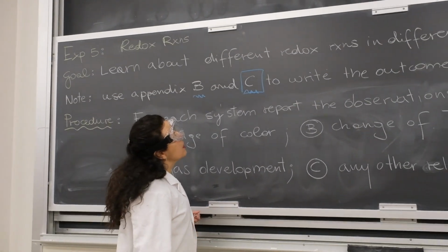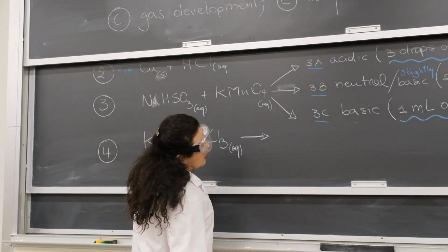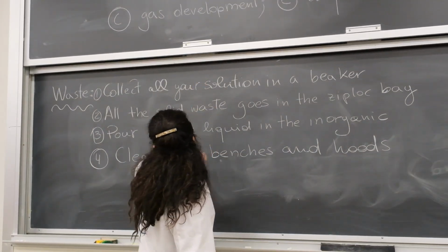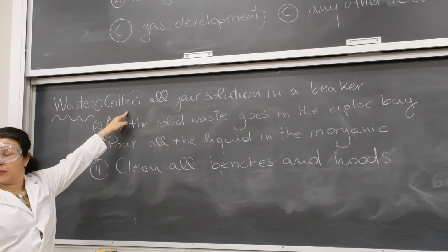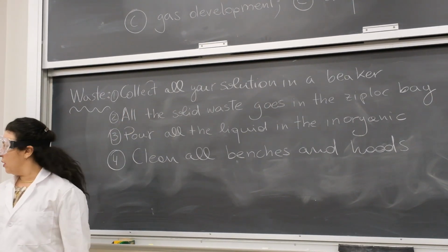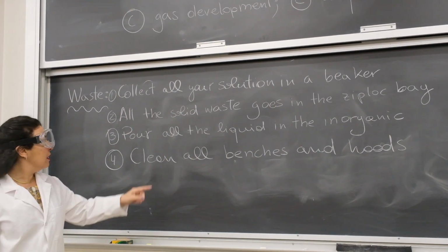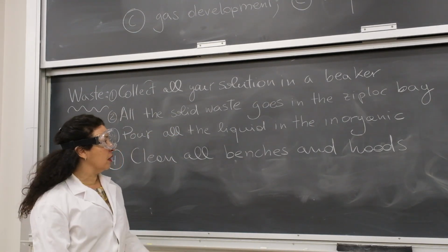So this is what we're doing for today. Last thing: collect all your solutions after you perform your reaction in a beaker, and then the liquid goes into the white bin. Any solid waste goes in the Ziploc.